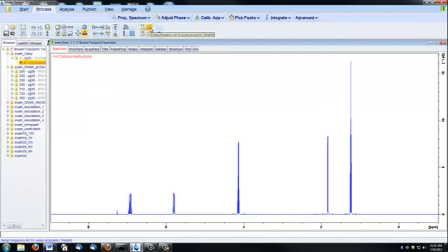Do not click this button. It's not going to help you, and you can potentially ruin your data. Finally, we have the multiple data set button, and that will be covered in a different video as it's pretty complicated. So to wrap this up, just remember that these buttons are here to help you, and it wouldn't be a bad idea to just sit down and play with them until you get familiar with what they do.